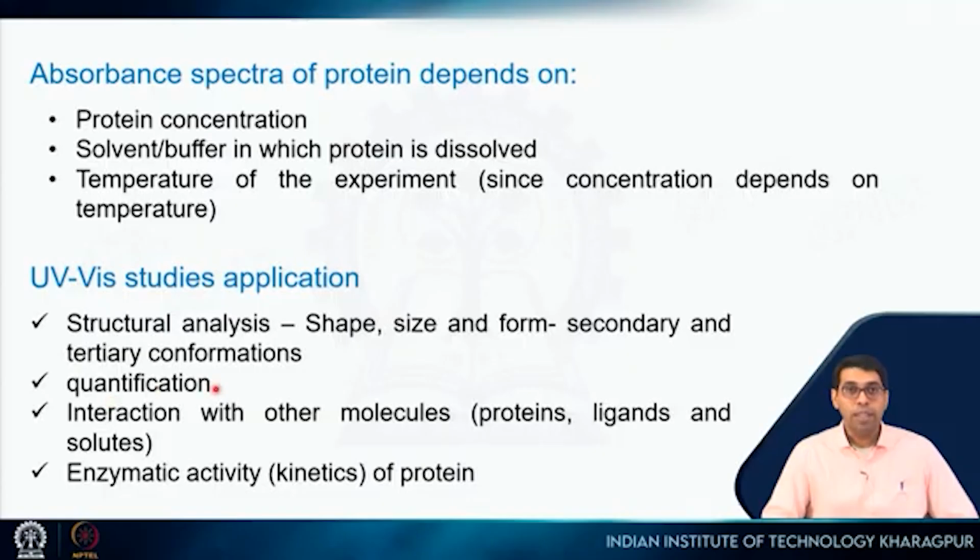We have already seen that we can use UV visible studies to quantify the amount of protein. So, it is very useful for quantification. We can also use this for interaction studies. And as I said, we can also use this for kinetics.